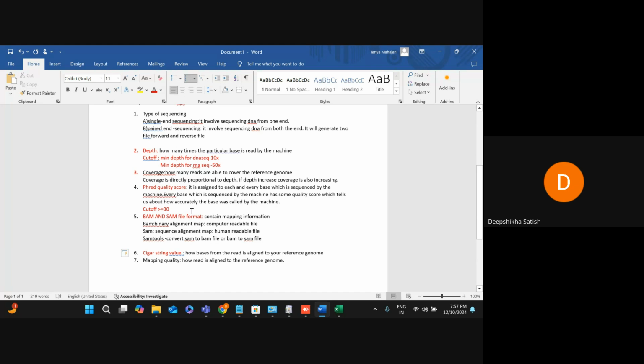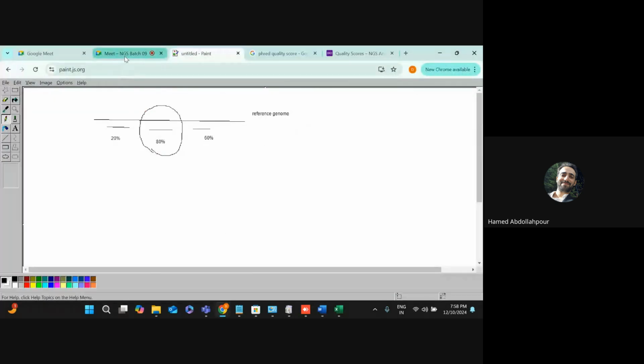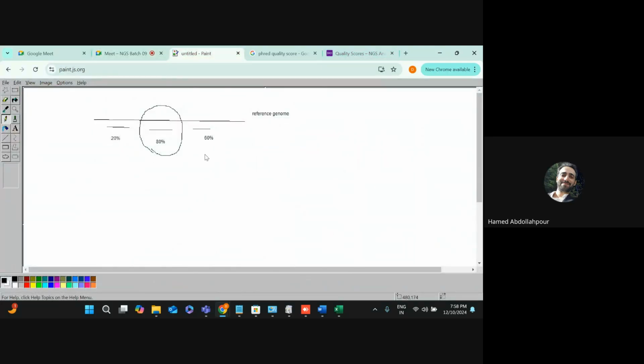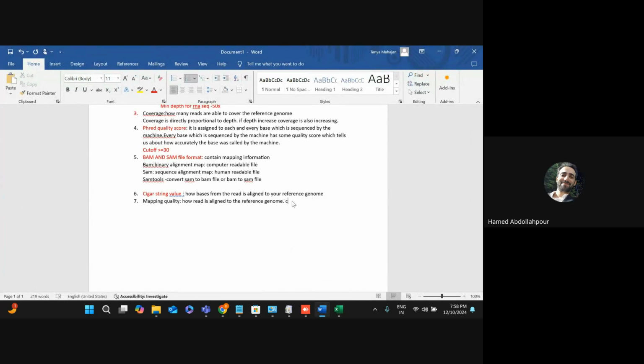Yeah. Any doubt? Professor, what about the two other reads? What should we do with the two other reads, I mean the 20% and 60%? Which ones, sir? At the point that you put. Yeah, these, sir. Again, like in the mapping quality, we are taking a cutoff.